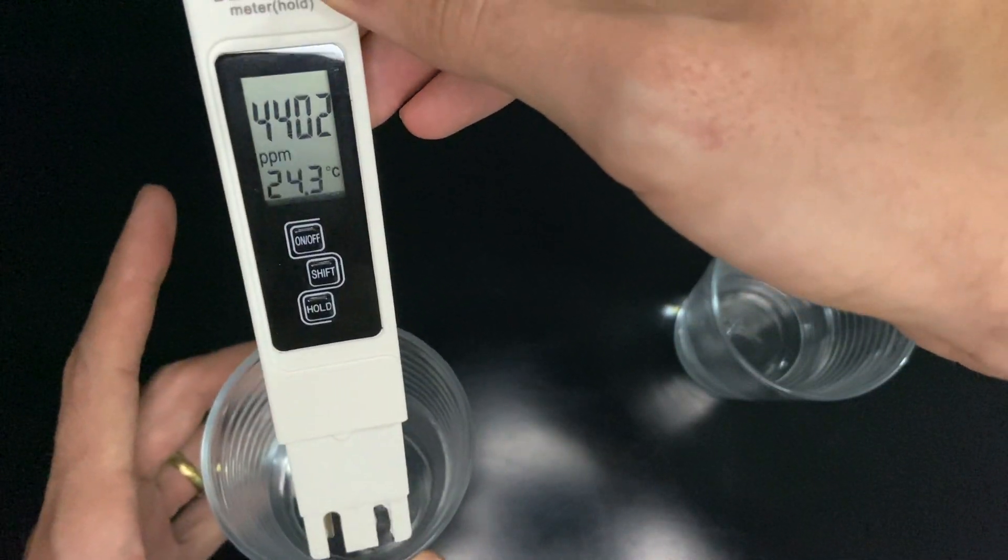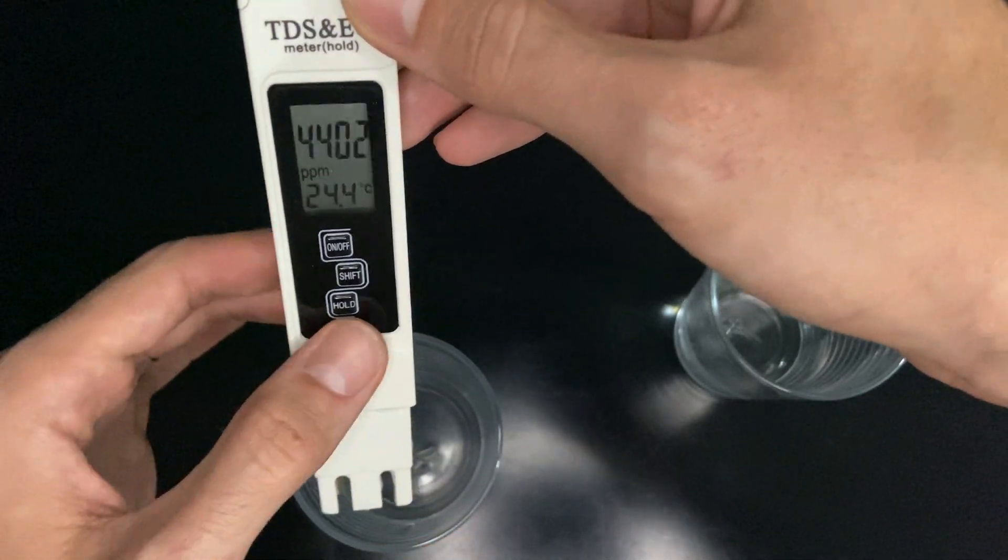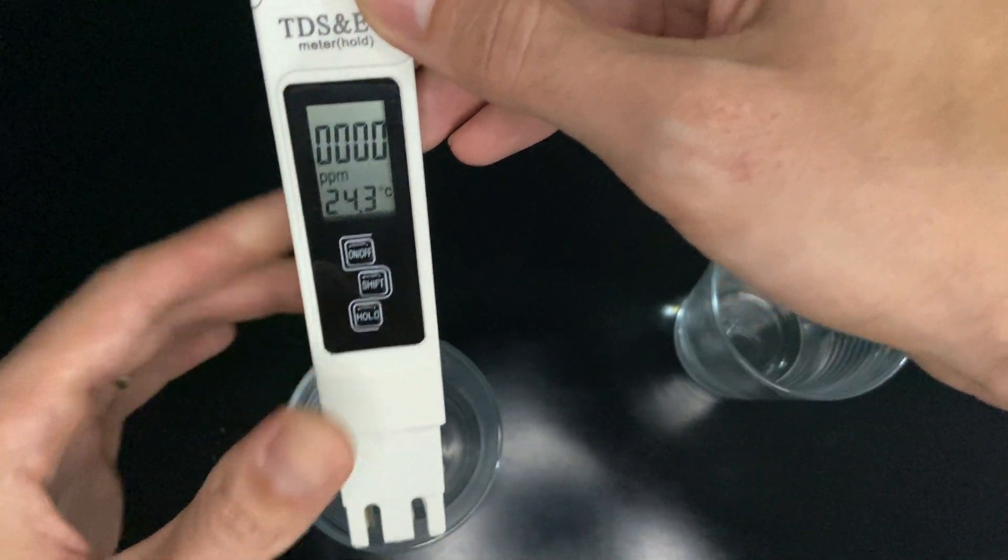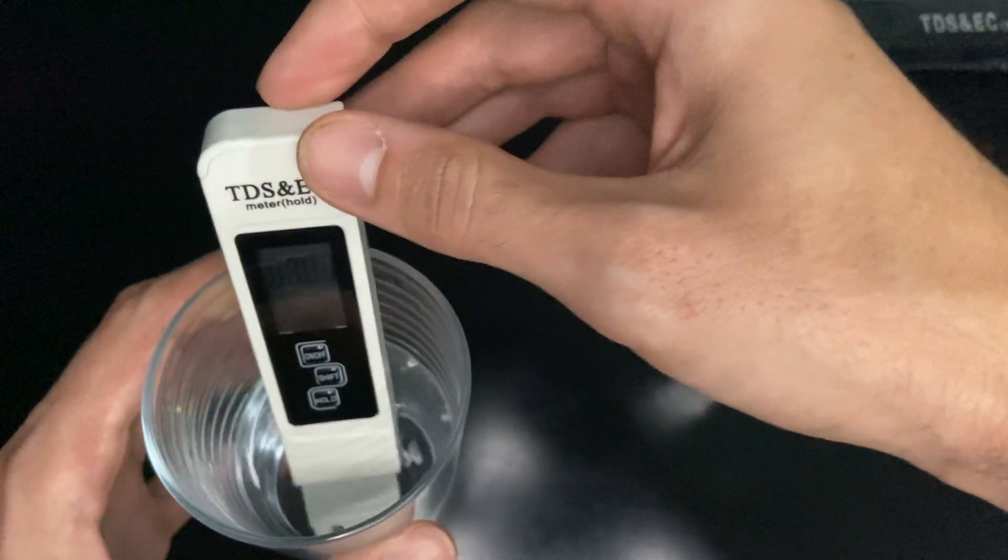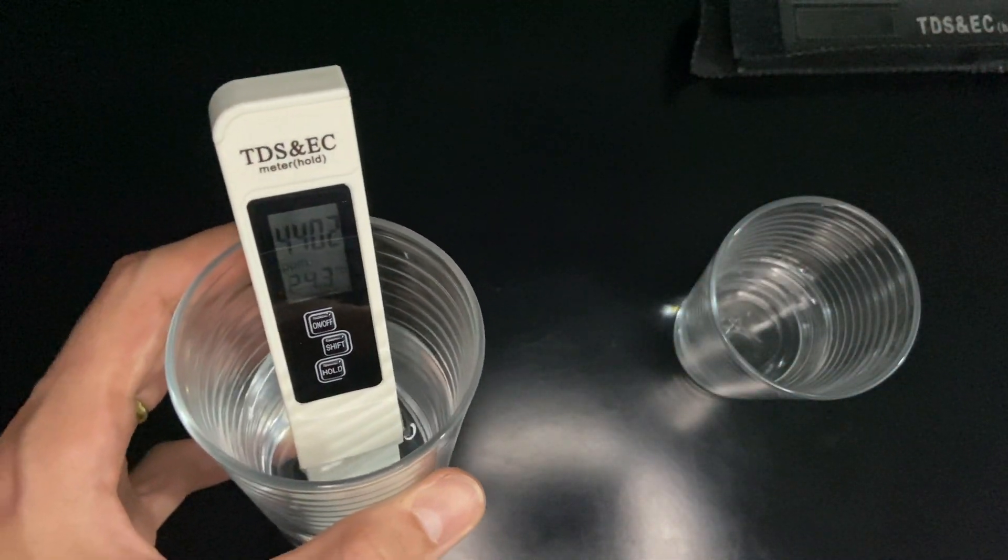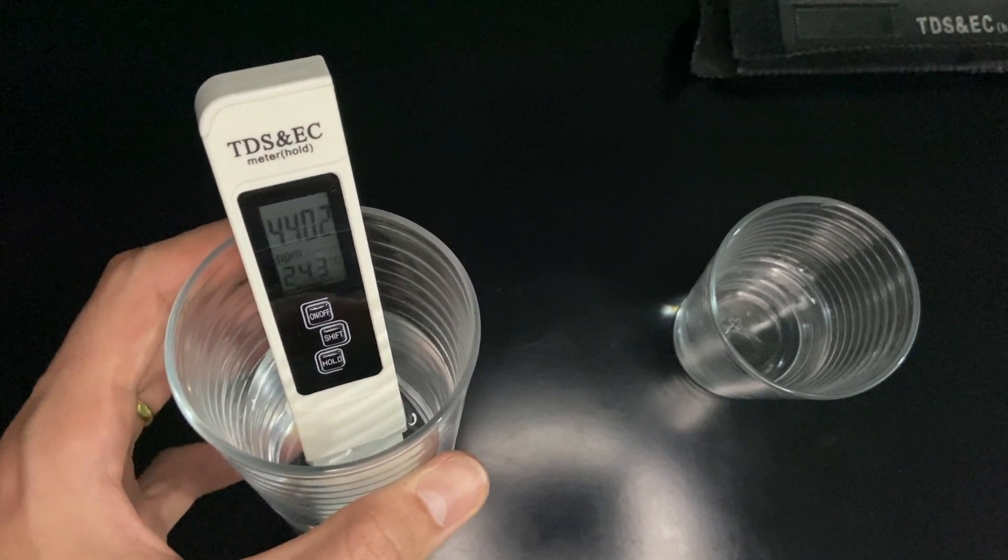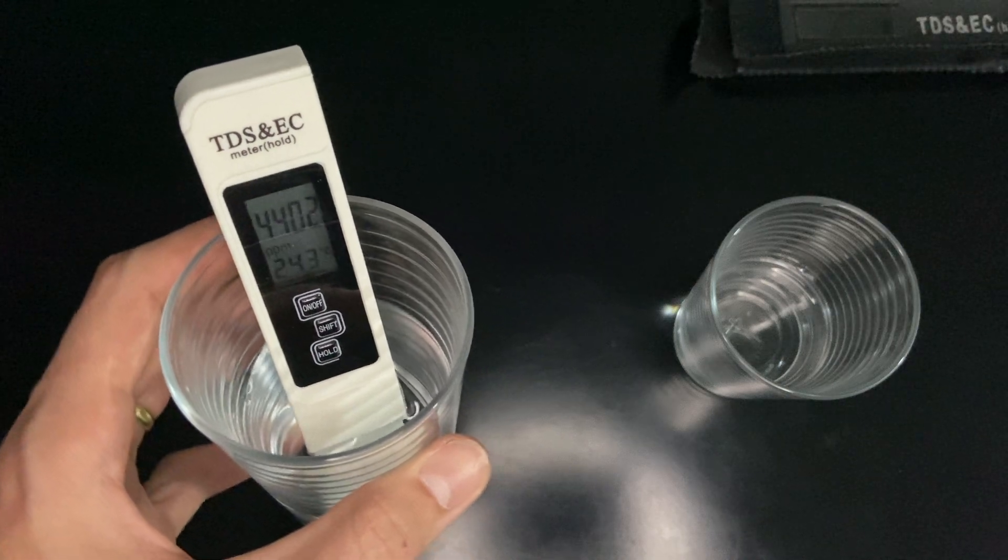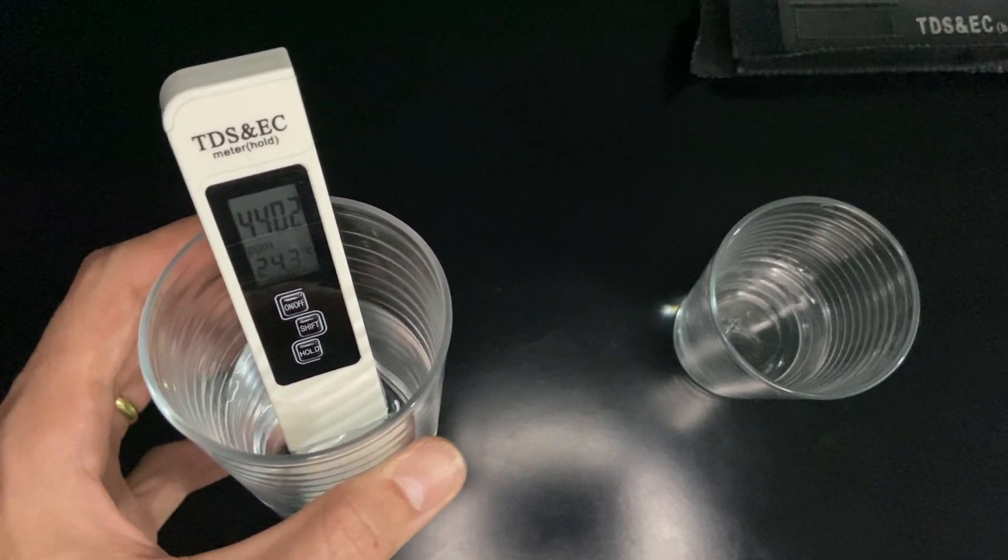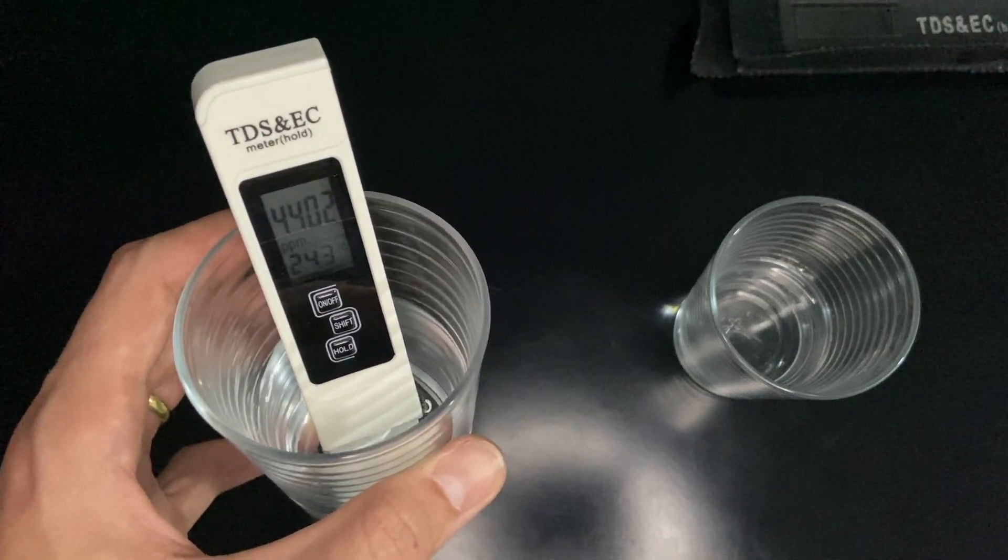So that's it guys. This is a really cool instrument to have at home, and also if you're a traveler who likes to travel to different places, it's good to know the quality of the water you're drinking.